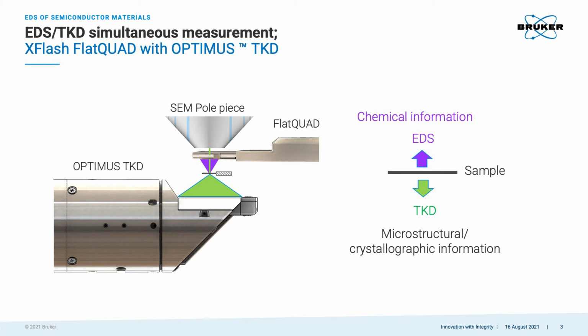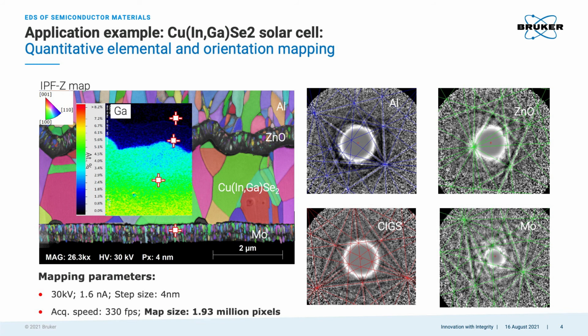And for that, different detectors are available. Yeah, it depends a little bit. In bulk, the background is higher, and one cannot check at higher energies. In TEM, we can check up to 80 keV. If you really have a strong overlap at lower energy, we can go up to 80 keV and check which element is really there.